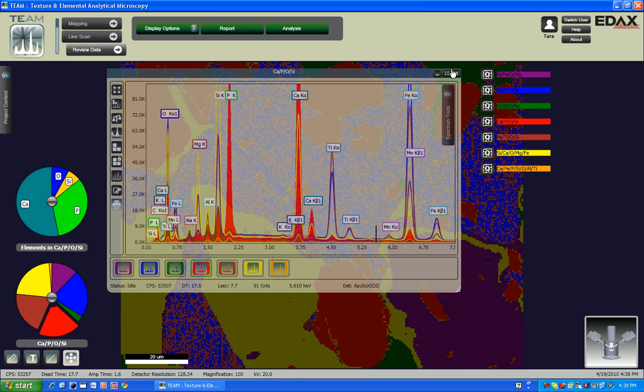This will now conclude the Team EDS mapping capability. Thank you.